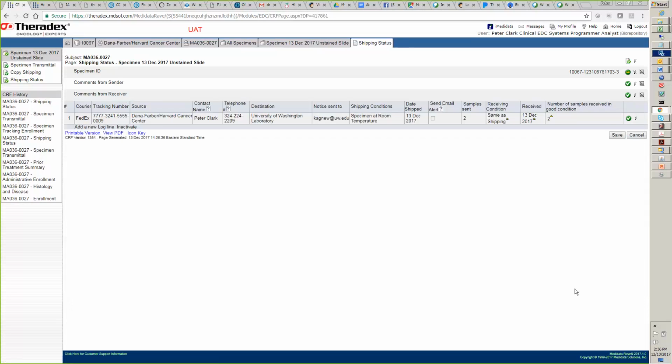So I have a question here because I do log other studies into Rave. What I'm wondering is, normally when I open it up and it just has that page there showing where I need to receive the specimens like we see at the bottom, I don't click on the green arrow. But usually there's not a green checked arrow, it's blank, until after I've received all that. So I'm just wondering what the difference is here.